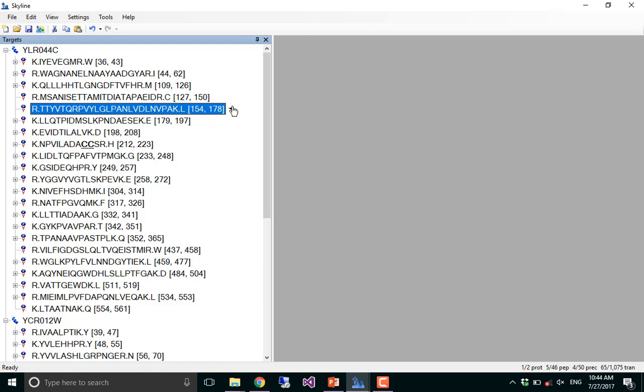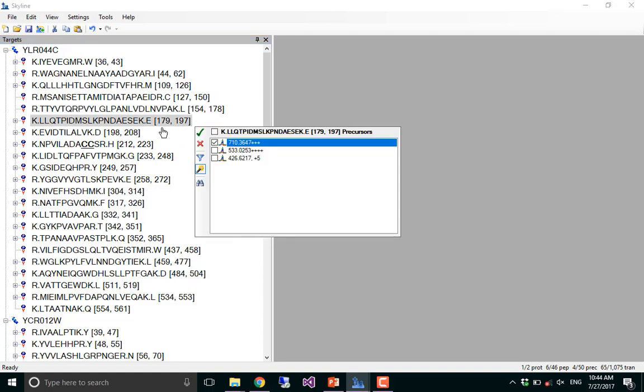Oh, because they're outside of 400 to 800 m/z? Oh, was I not supposed to answer that?